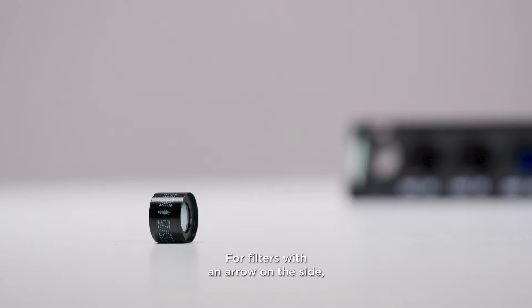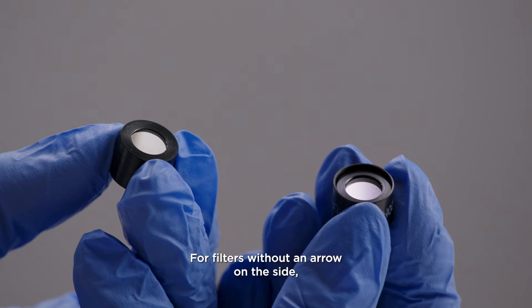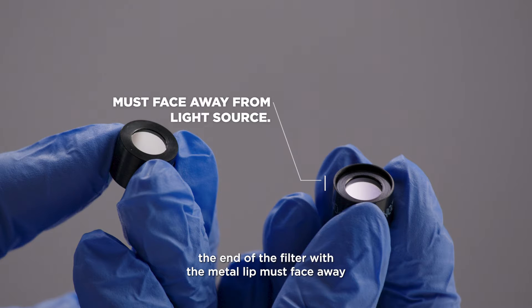For filters with an arrow on the side, light must travel in the direction of the arrow. For filters without an arrow on the side, the end of the filter with the metal lip must face away from the light source.